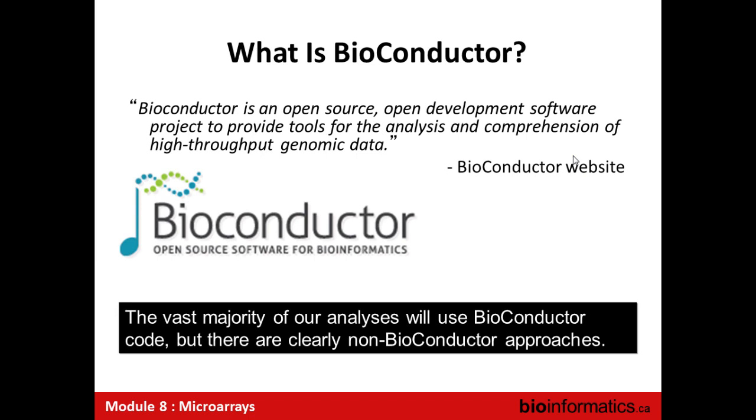The vast majority of microarray analysis happens in an R-based environment called Bioconductor. Bioconductor basically happened when a series of high-profile statisticians came together and said, we want to analyze microarray data, but I don't really want to have to worry about how you read those file formats. Can't we make a standard library that we can all use so I can put my effort into doing the interesting statistical problems? And they built a highly robust software framework called Bioconductor. That is the majority of how microarray data is analyzed, easily 95%. There are non-Bioconductor approaches, which are sometimes really, really good, but it's a safe bet that if somebody used Bioconductor, they are more likely to have gotten it using best-in-breed algorithms than if they didn't.